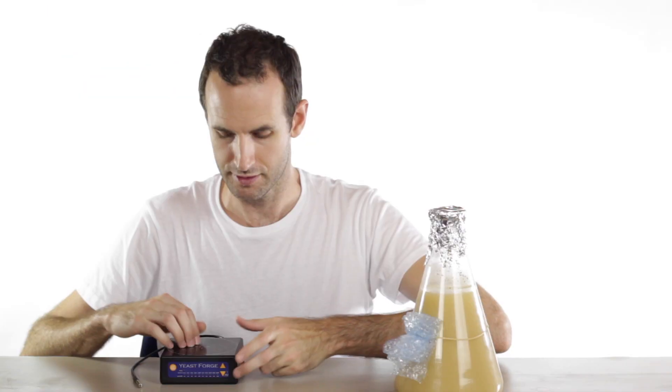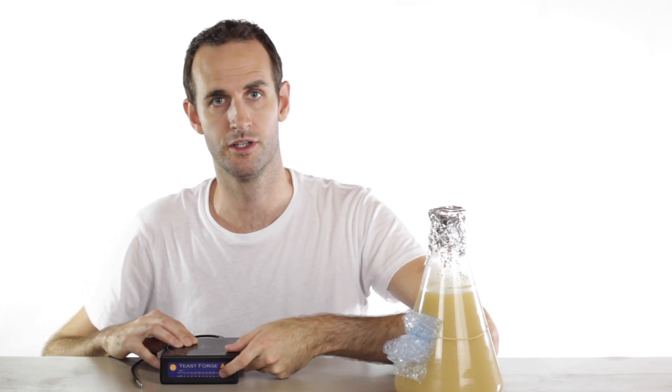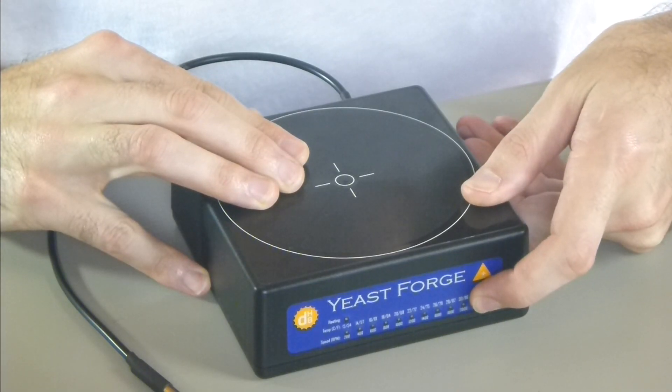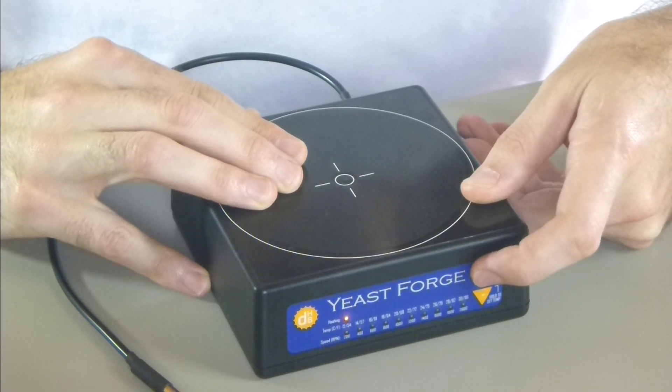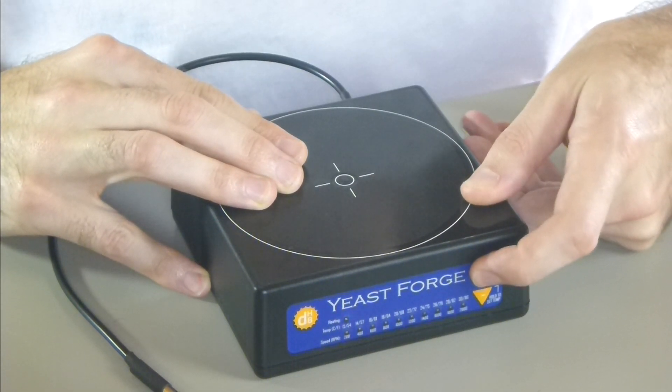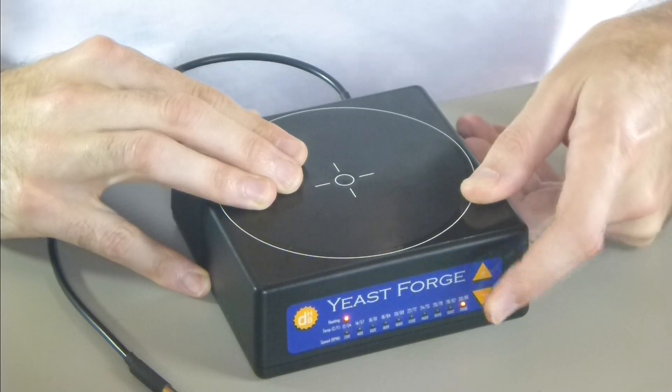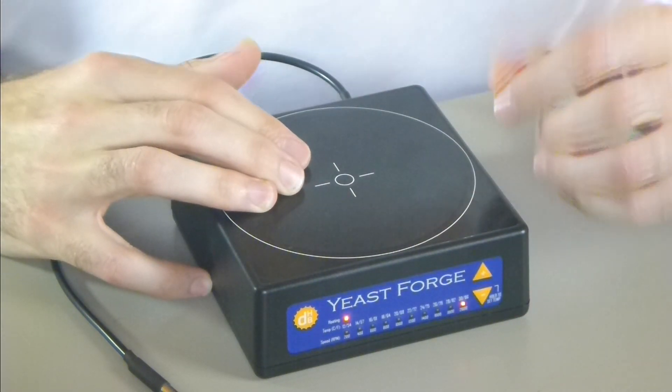So to set the desired temperature, you simply hold the down button when it's turned off. It beeps twice so you know you're in temperature set mode. And then you can set the temperature anywhere from 12 degrees Celsius to 30 degrees Celsius. And that's also written there in Fahrenheit as well.